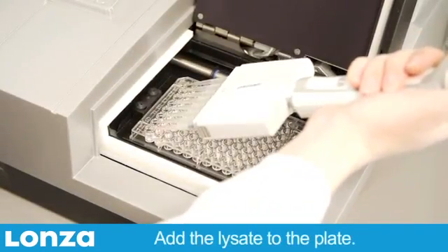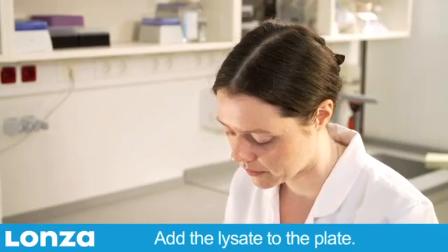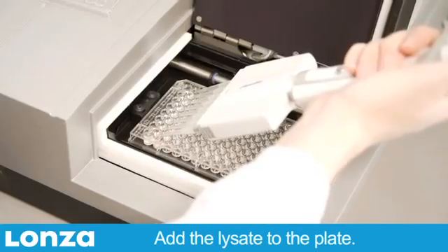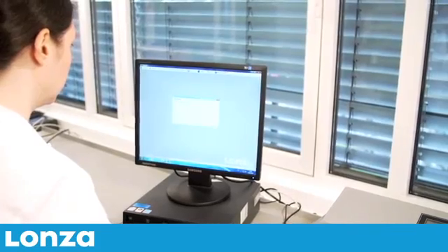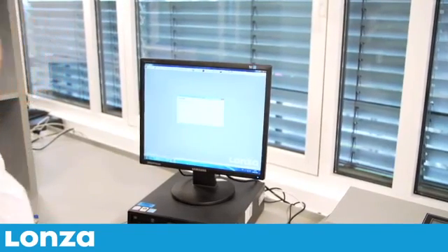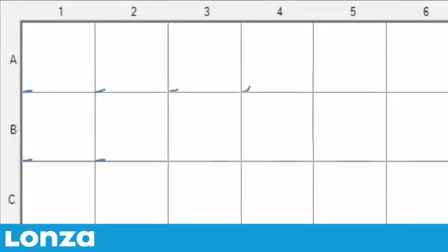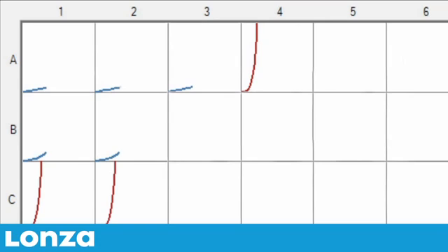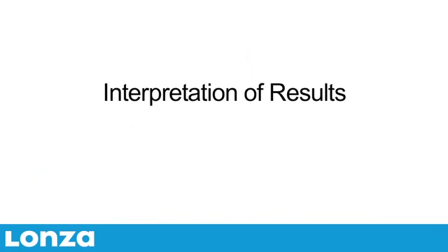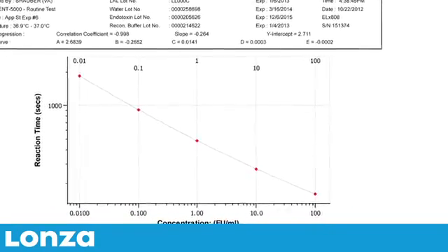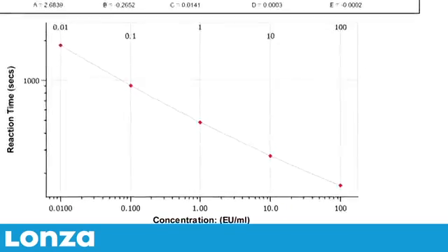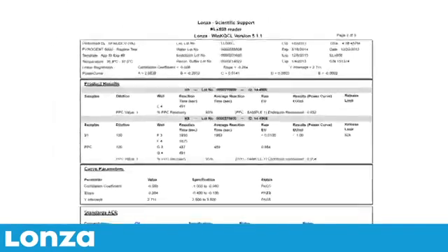At the end of the incubation period, dispense 100 microliters of the lysate into the appropriate wells of the microplate using an 8-channel pipetter. Click the OK button in the software to initiate the assay. The microplate reader and WIN KQCL software continuously monitors the absorbance of each well of the microplate throughout the assay. The WIN KQCL software automatically creates a standard curve via a logarithmic transformation of the reaction time of each standard with its corresponding endotoxin concentration.